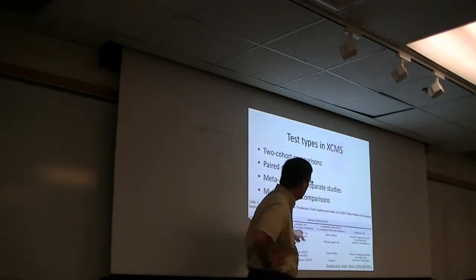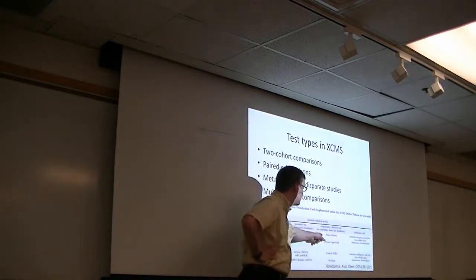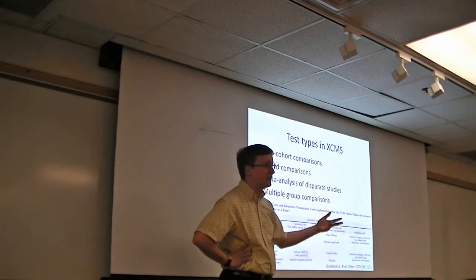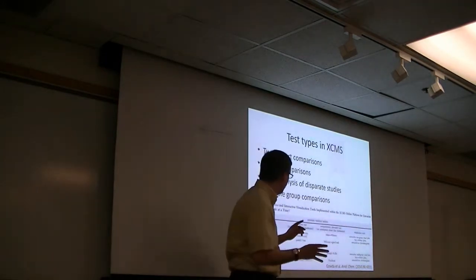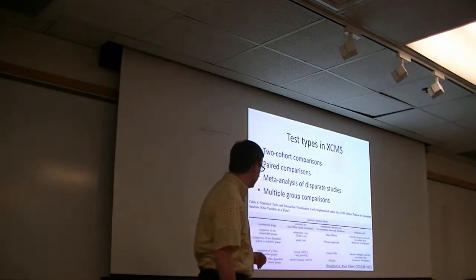Now, it may be that you want to make use of the fewer assumptions of a non-parametric test. And so they've got the Mann-Whitney or Wilcoxon test in here. The Wilcoxon is the signed rank test. They use this for evaluating basically how much the rank changes from the early to the late. And they also have a fair number of visualization tools built around that.